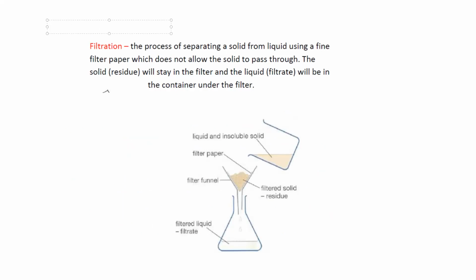So if you want to separate insoluble or undissolved solid from the mixture, we can use this technique called filtration. For example, if you have sand mixed with water, or you have extra salt in water which does not dissolve, you can simply carry out this technique of filtration.